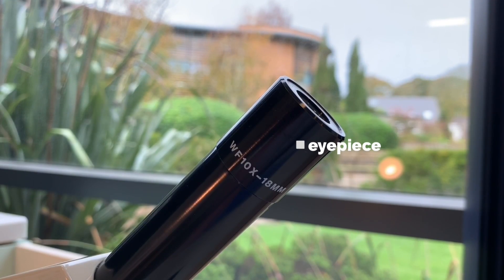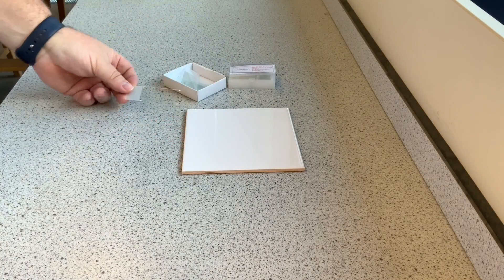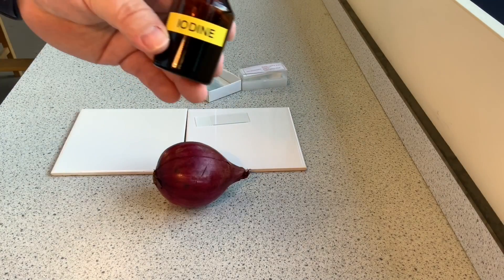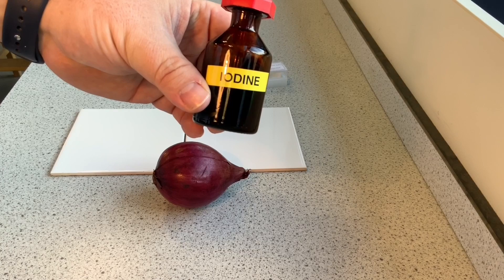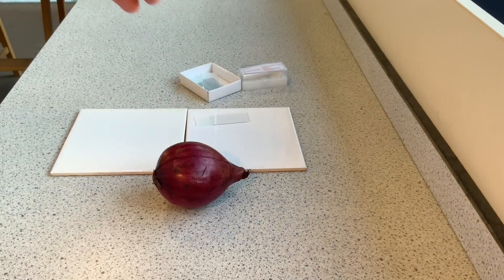Then we have the part we look through which is the eyepiece lens. Let's now have a look at how we can prepare a slide with onion cells. So the equipment we'll need is a glass slide, some iodine to stain the onion cells so we can see the organelles a bit clearer.